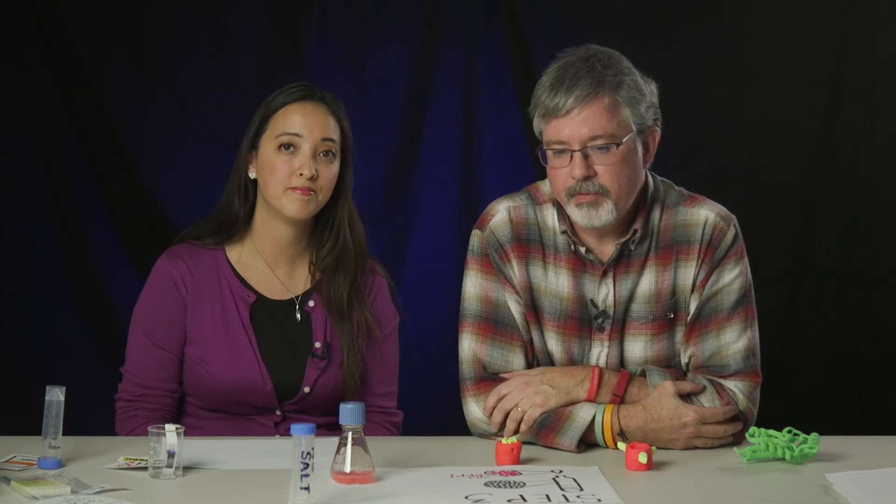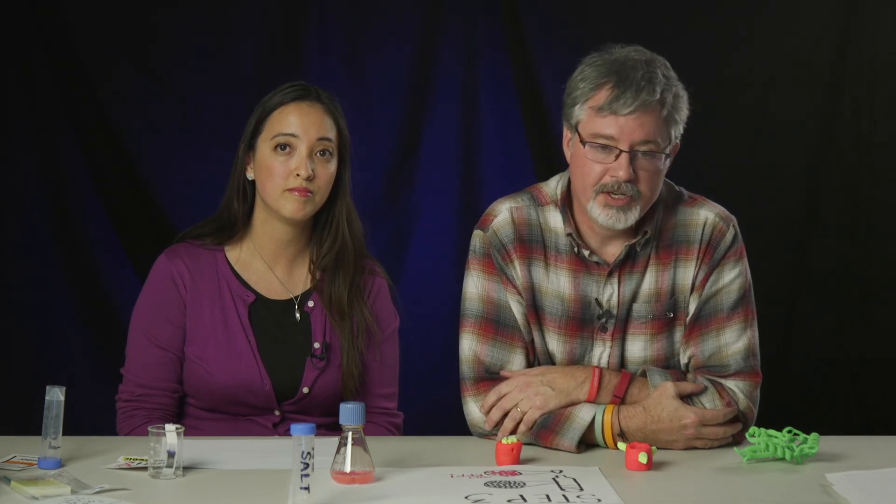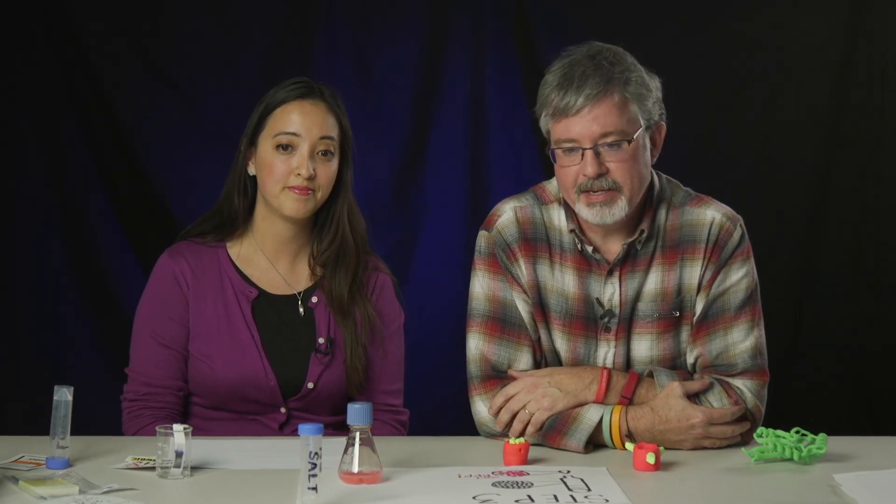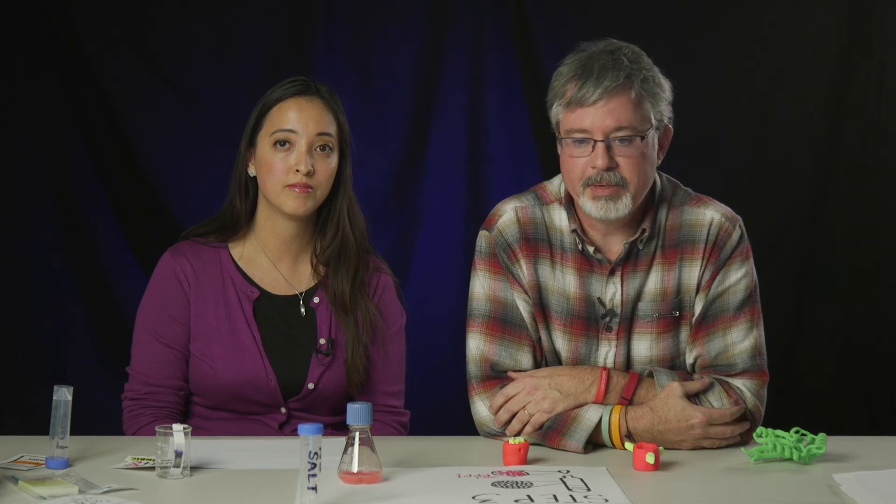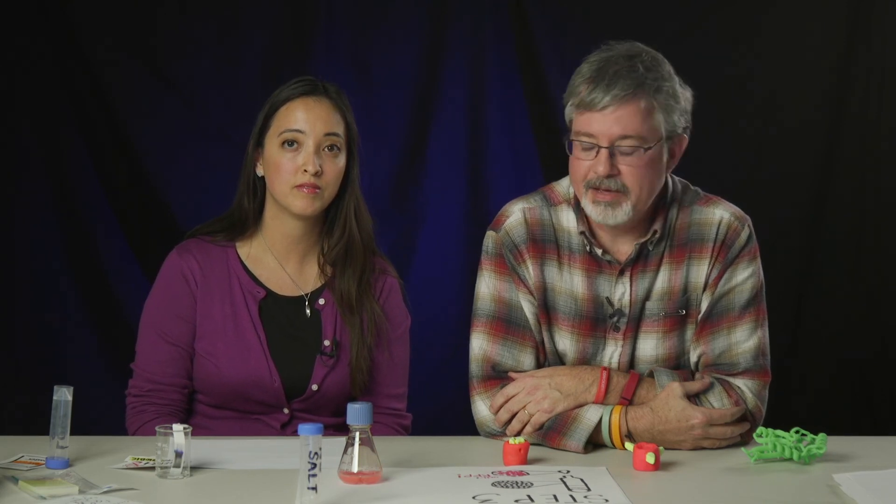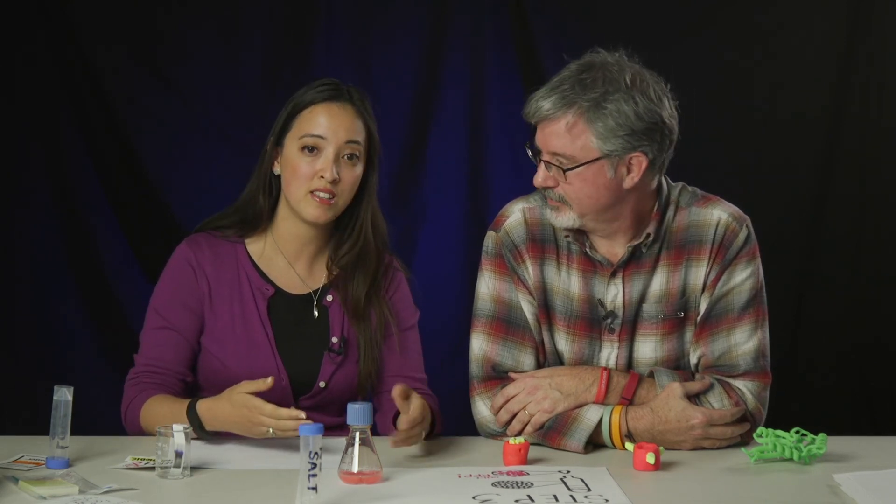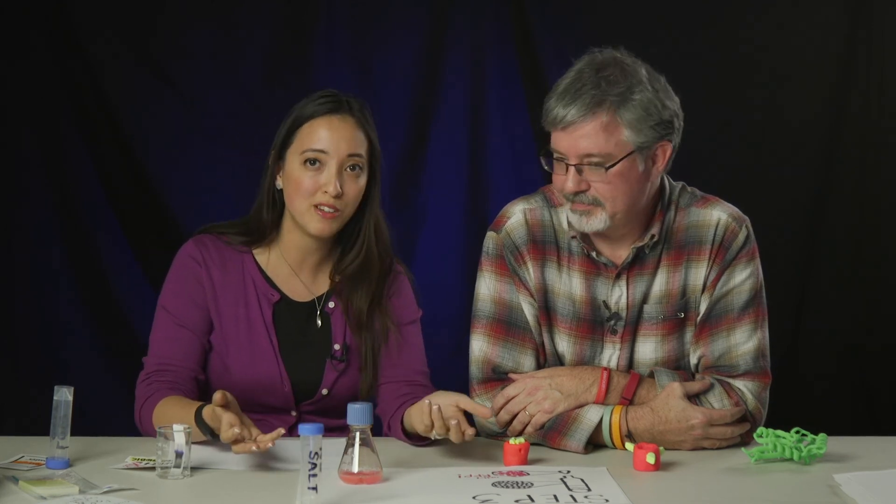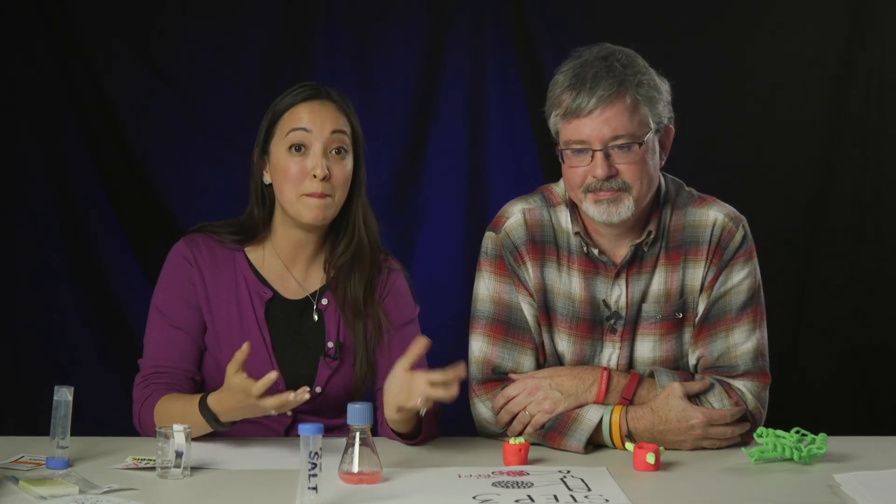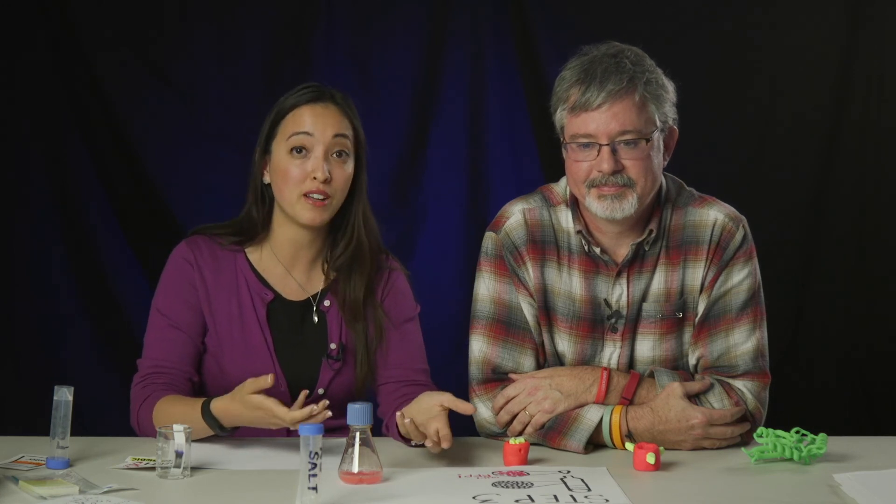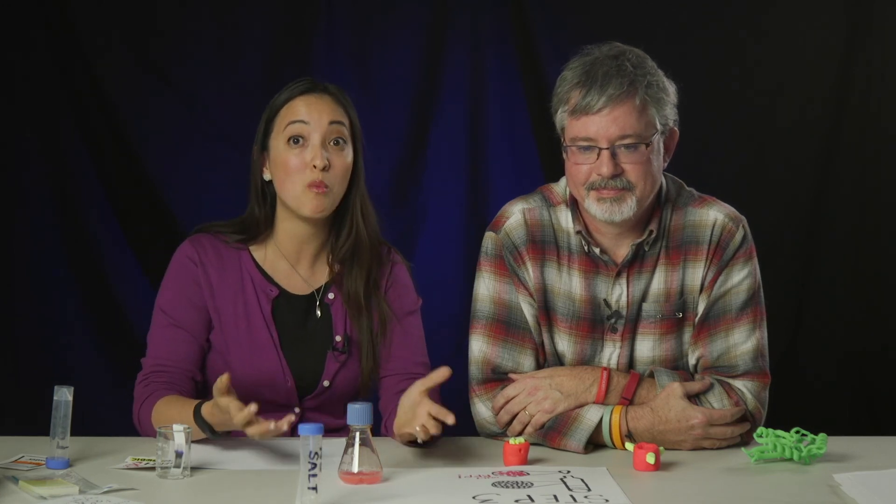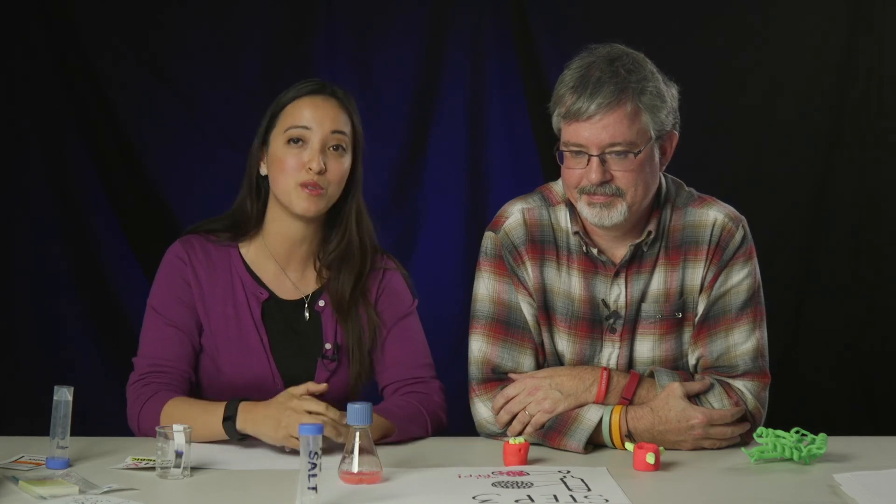So one of the questions you might have is, why do we do this? Well, we're moving into an age where we can actually turn proteins into medicine. For instance, insulin. You may have friends who have diabetes or parents or guardians, and this is a medicine that we can produce by making a protein. And it's really helping people have healthier lives. So this same process - the bacteria making the protein for us, us busting open the cells, putting that mixture into a column, and then separating out the different kinds of protein until we get the protein that we want, based on the interaction with the column and the different solutions.